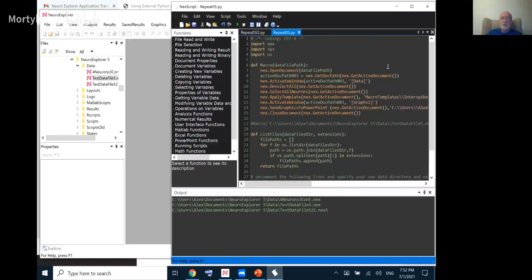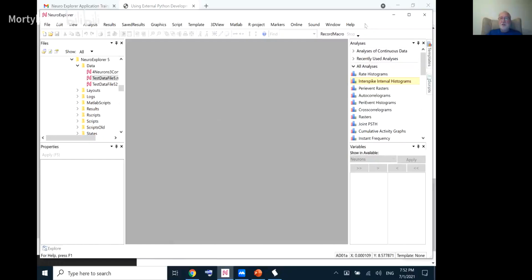We went back and forth on some fancy burst analysis when one professor in Germany with some guys in Howard Hughes Institute here in the States wanted to load a new data file format. I wrote the script for them. Yeah, so I'll be glad to help you and provide you with the script. I actually even developed a way to send those scripts to the customers.